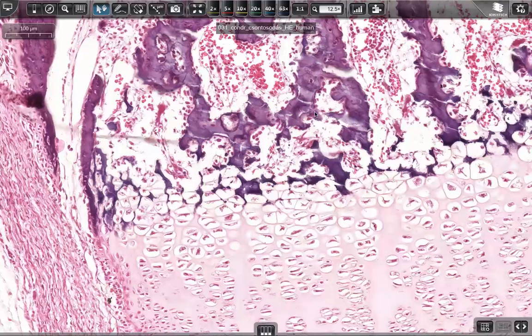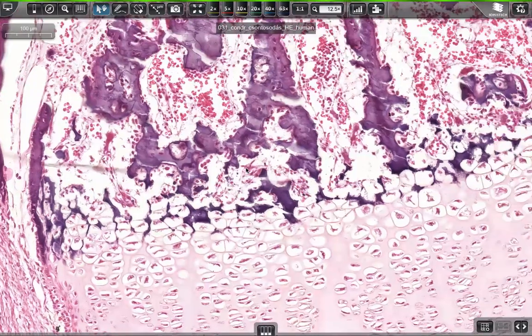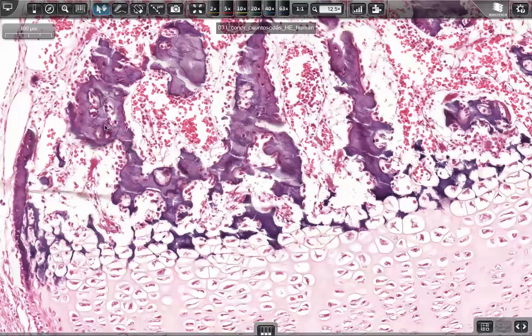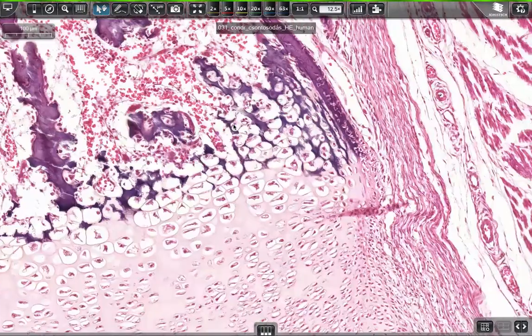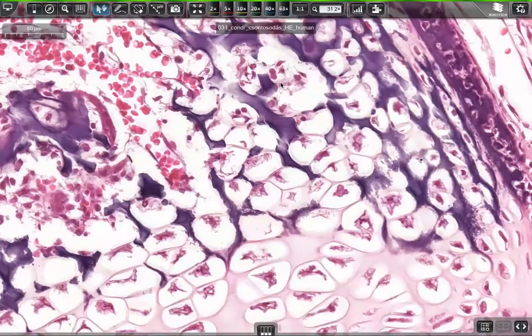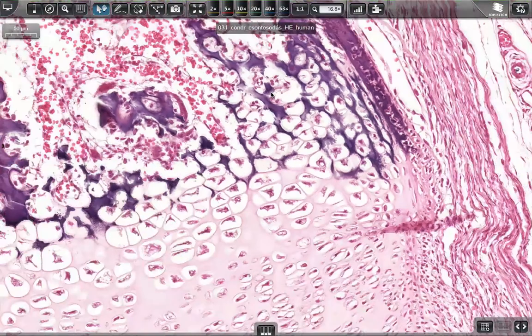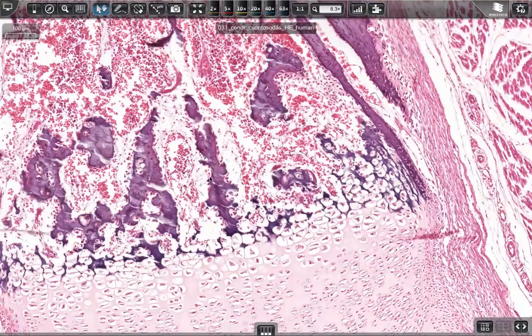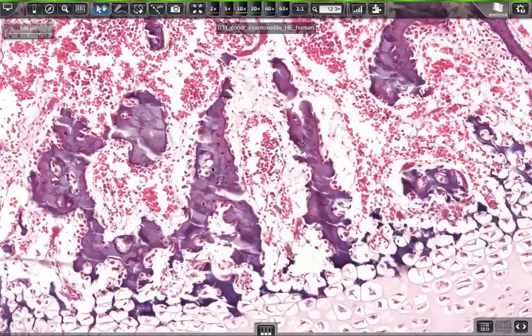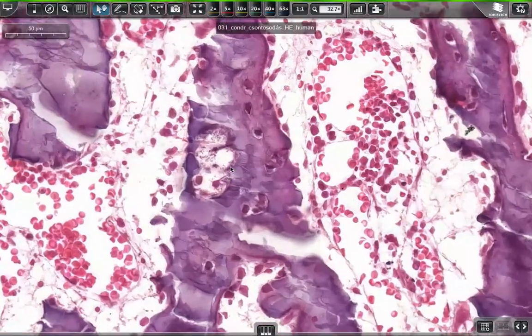the cartilage matrix breaks down. So here these are parts of the degenerating cartilage. I can see they are dying cells. Look at that here as well. They're completely destroyed by the deprivation of gases. And when we zoom in here, this area, this is the best area.